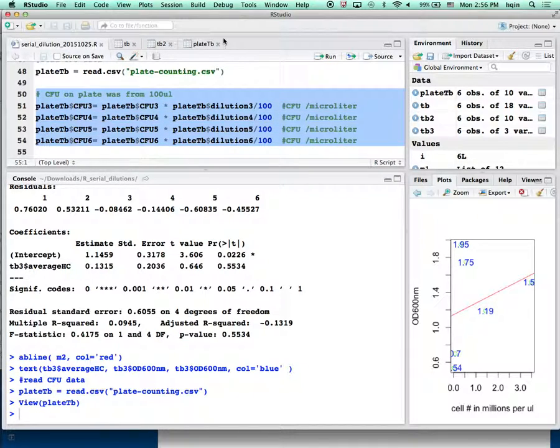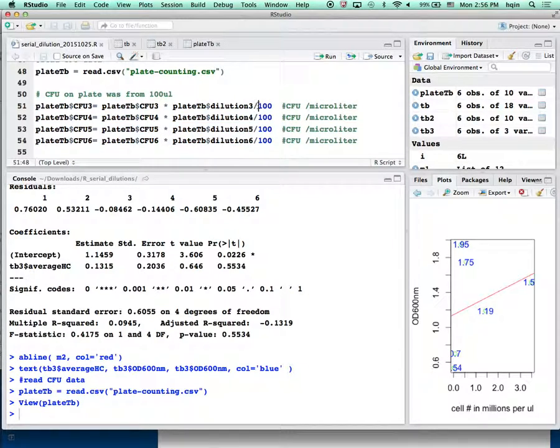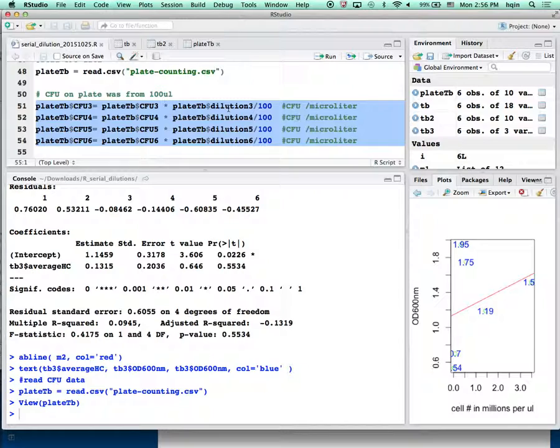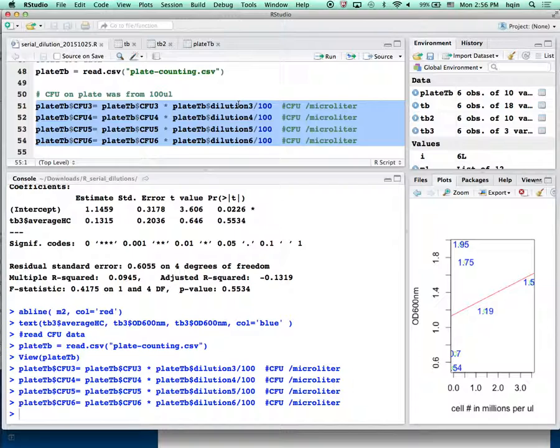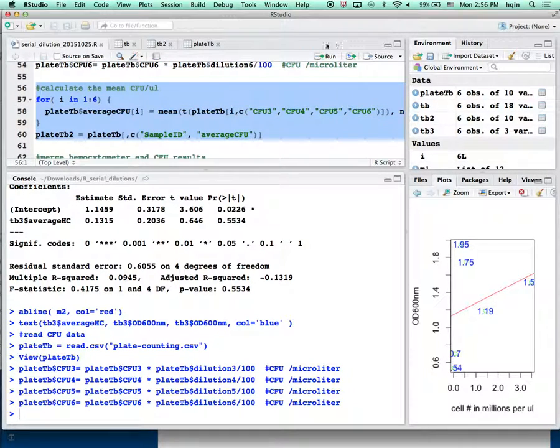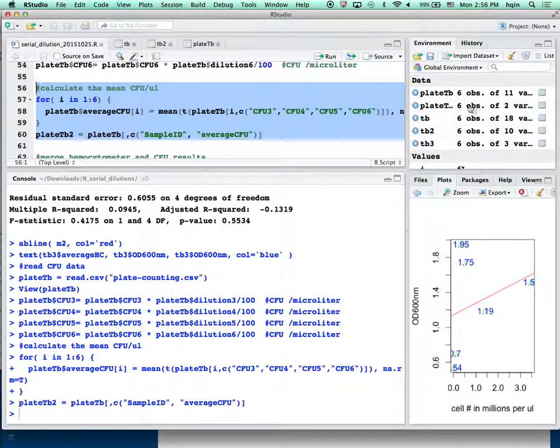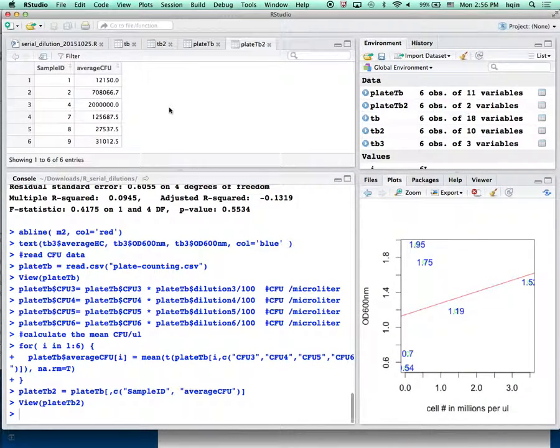We can now calculate the serial dilution concentrations. You need to remember how much volume we put on the plate — we put 100 microliters on the plate, so that's why I divided by 100. Then we multiply back by the dilution ratio to get back to the original concentration. So divided by 100 gives the plate concentration in CFU per microliter, then times the dilution ratio gives back the original. Then we calculate the average.